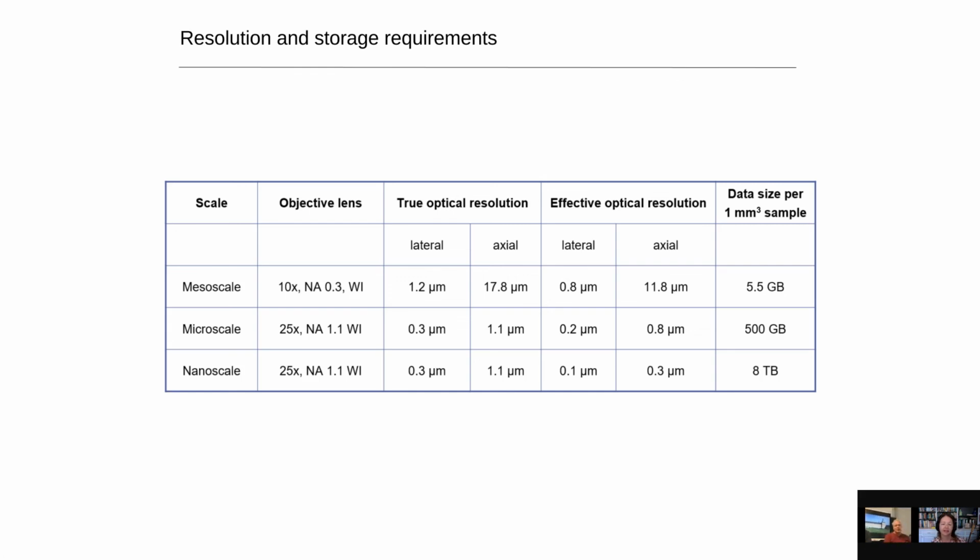So we call that a virtual resolution, because the expanded sample, of course, you have to resize, and you don't really improve the optical resolution. This is clear, but you get a virtual resolution in your sample because it is simply larger. And so we really come down to values that normally are considered to be super resolution.